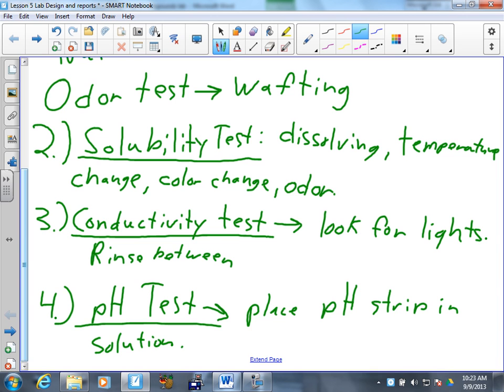And then lastly, the pH test. Remember, we're doing the pH test last because when it happens, a chemical change occurs and then the substance is no longer any good for doing any of the other tests. So what if you do the pH test and then you start to get that uneasy feeling where you might have done something wrong with that material previously? What should you do? Do it again. Yeah, go get a fresh sample. Okay, there's lots, so if you think you need to do a test over again, go get a fresh sample and do it again. All right, don't be afraid to do that. Okay, if you think you've made a mistake, definitely do that. All right, questions on that?